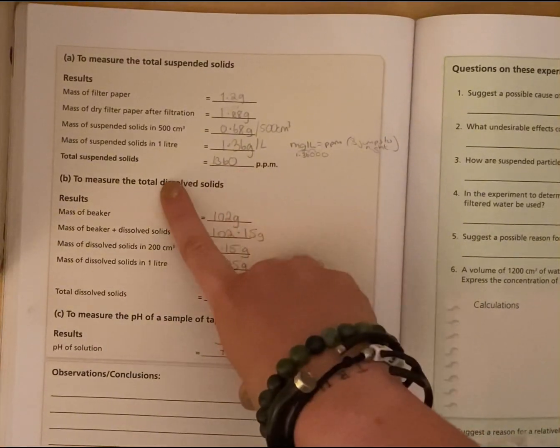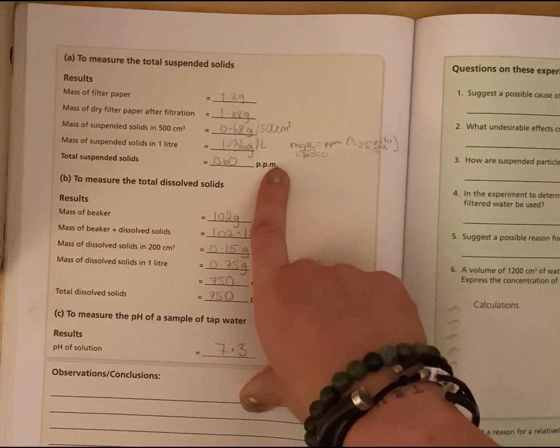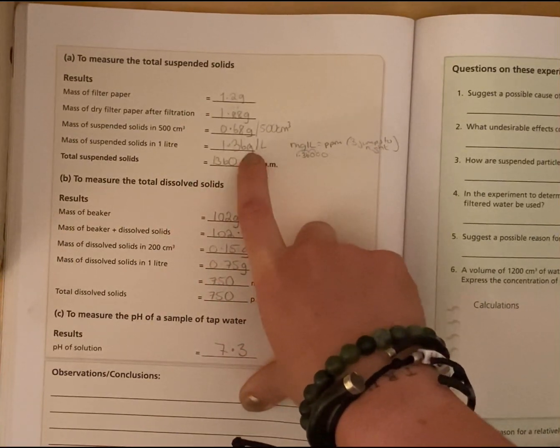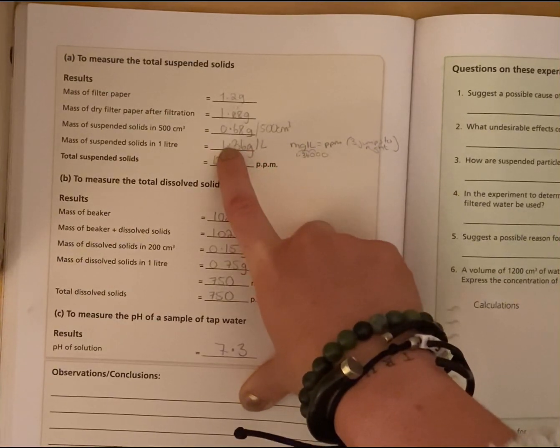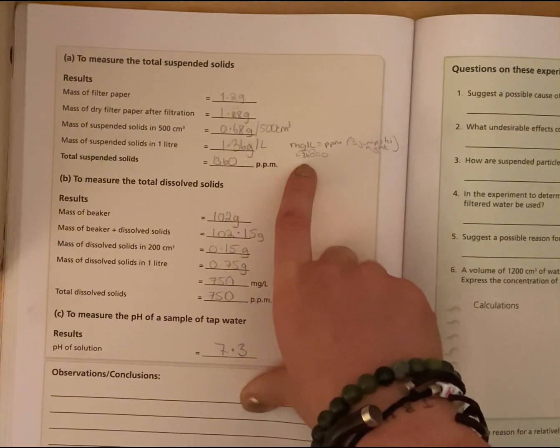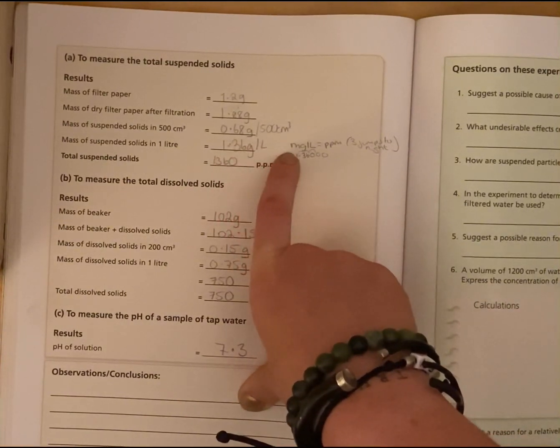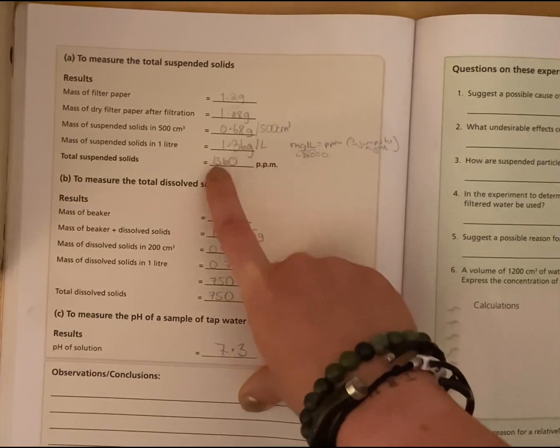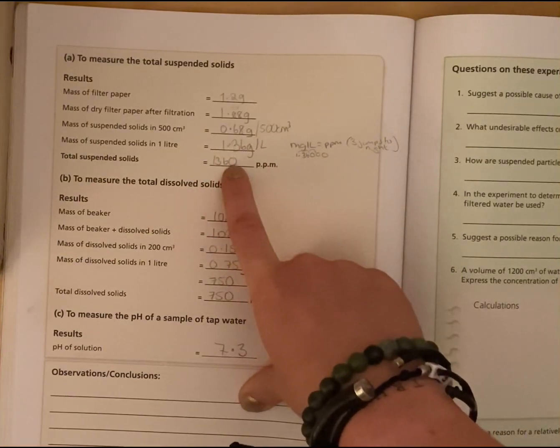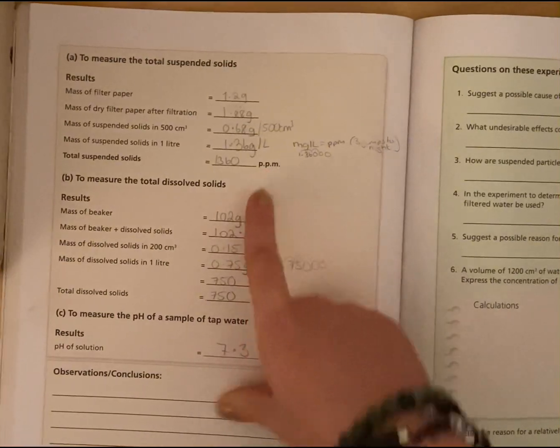So total suspended solids are in parts per million, which is milligrams per litre. So we're going to change grams to milligrams. So you're going to move the decimal place 3 to the right. So when you do that, you know, 1 jump, 2 jumps, and there's imaginary zeros all here. 3 jumps, 1,360 parts per million for section A.